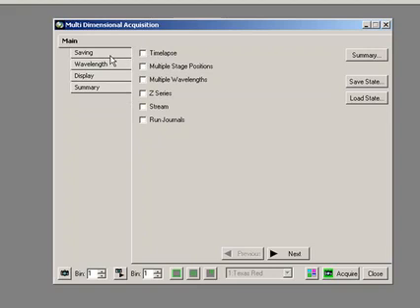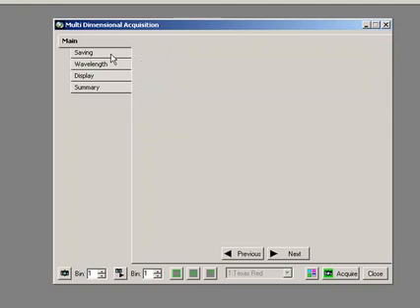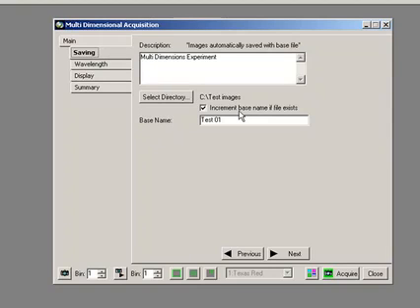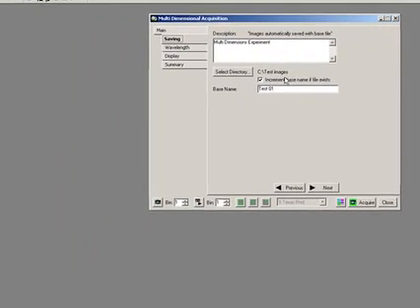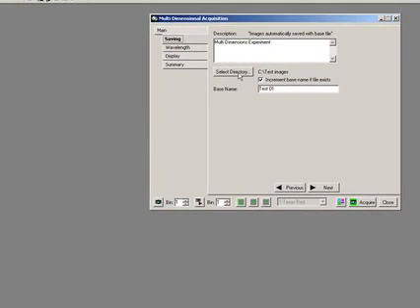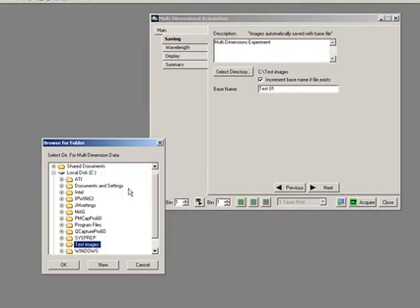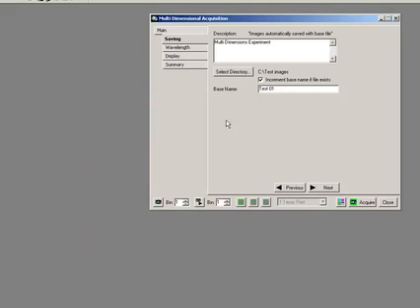So first of all, the first tab as I move downwards is saving. Where am I going to save that image to? We actually have a directory, and we can say select directory. You can see here I've just created a folder called test images.